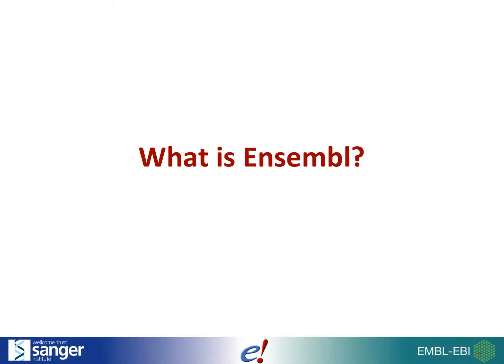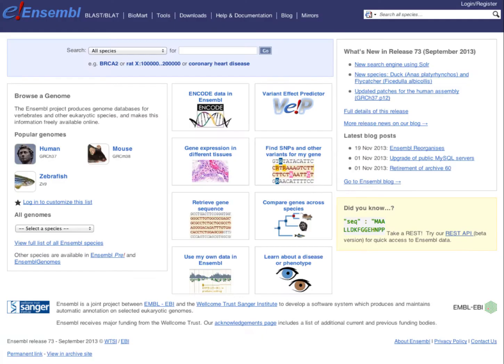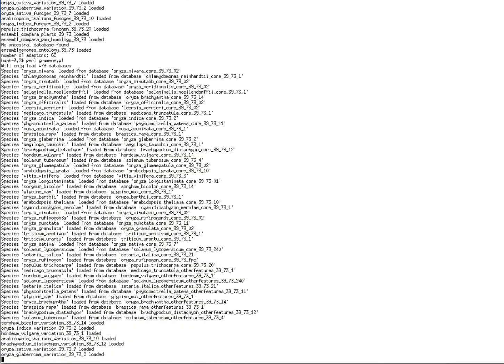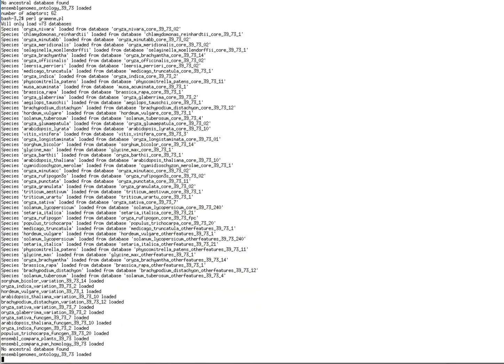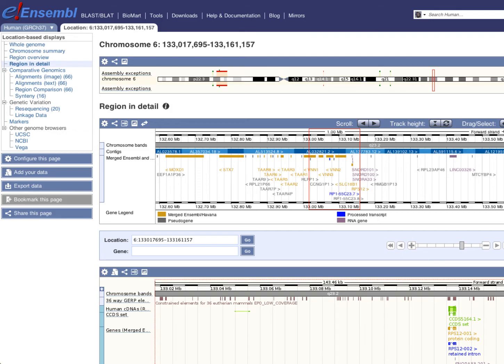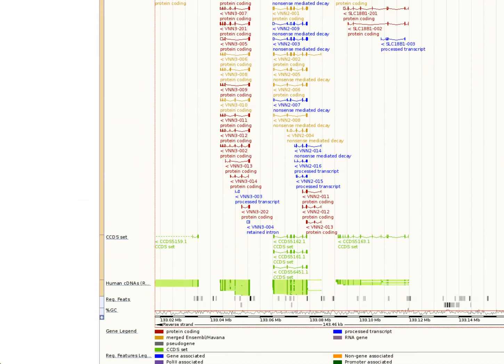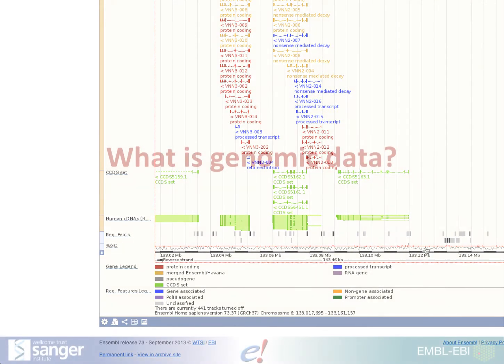So what is Ensembl? Ensembl is a genome browser. Genome browsers make genomic data accessible. To do this we provide a database, which you can access directly, and we also present this data in a web browser.